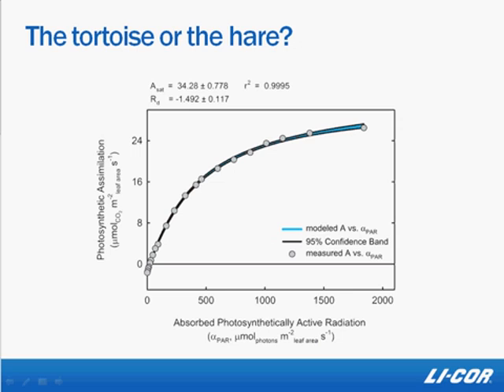So light response curves can be done in two basic ways, although, as usual, there are endless variations within these two ways. A fast light response curve starts with a light-adapted plant and goes down to 0 light. Light is off. This typically takes 30 minutes or so, depending on how many set points you have and how long you spend at each. A slow light response curve starts at 0 and goes up slowly to a saturating light level. Plants respond to reductions in light much faster than they respond to increases in light.